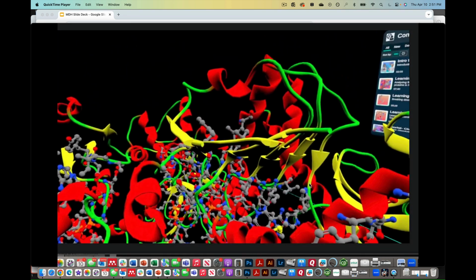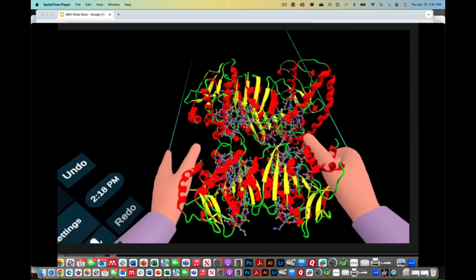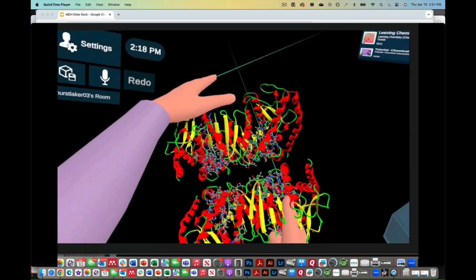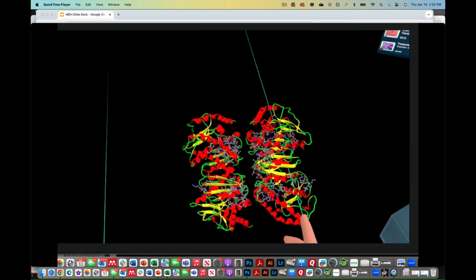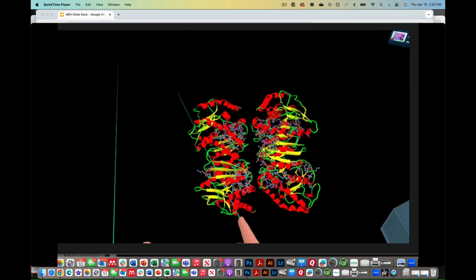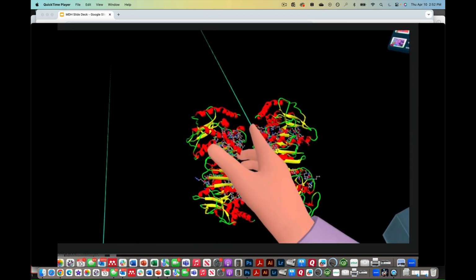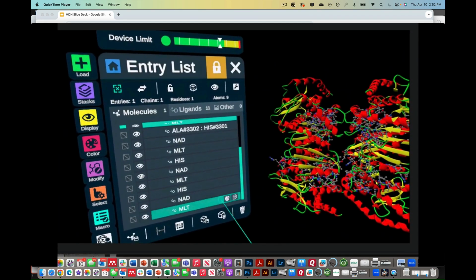If you keep your eye on it, you can see how tiny that enzyme active site is within the context of the entire protein. A little bit easier to look at now that you can see the entirety of this protein here. Again, malate dehydrogenase is a dimeric protein, so here's the 2 monomers that we have. Here's the dimer interface. Some of our mutants that we're looking at are mutated in that dimer interface.